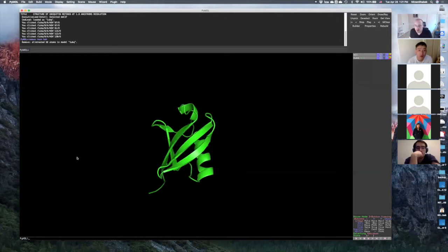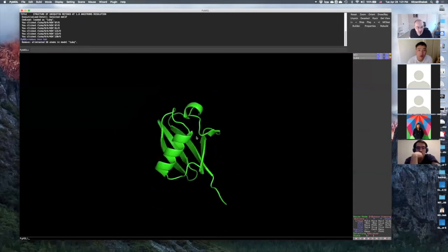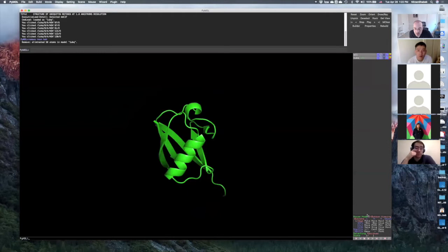So the next thing is, let's try to understand what's happening with this structure and how we can change different elements. One thing I want you to pay attention to: here there's this panel that's talking about the different parts of the things that I can change. And here there's also the mouse mode that we are using. The mouse mode that we're using is 3-button and we are in viewing mode, okay? Keep that on viewing mode unless we're going to do another, more advanced session where we can change this to editing. So if I just click that, it will be edit. This is just viewing, okay?